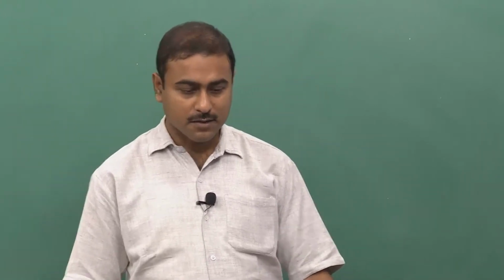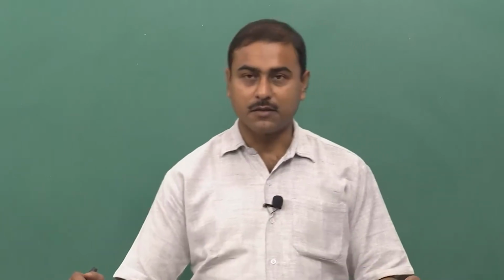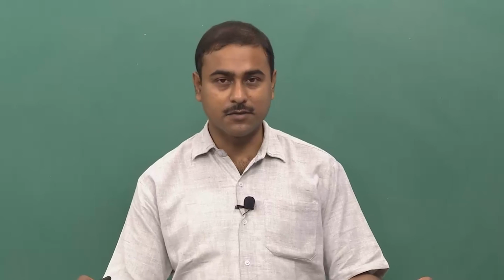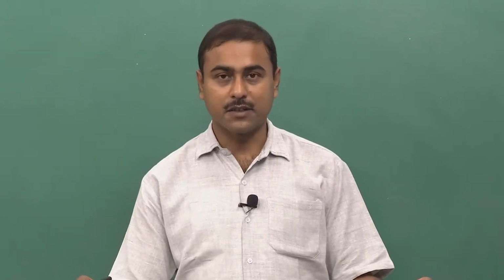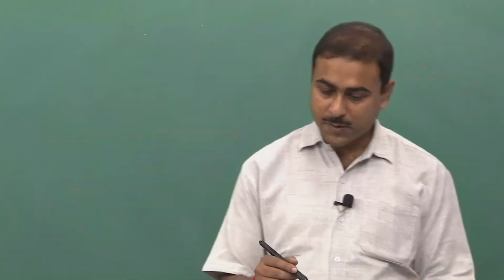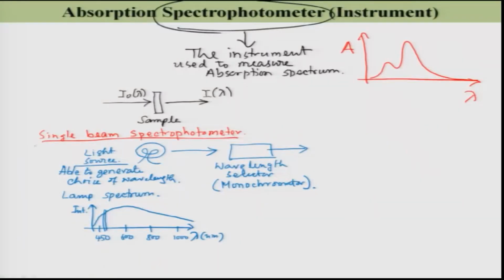In the last class, we discussed the instrumentation of the absorption spectrophotometer, the device used everywhere to measure the absorption spectra of a sample. And we started with a single beam spectrophotometer, as I was doing in this particular place.